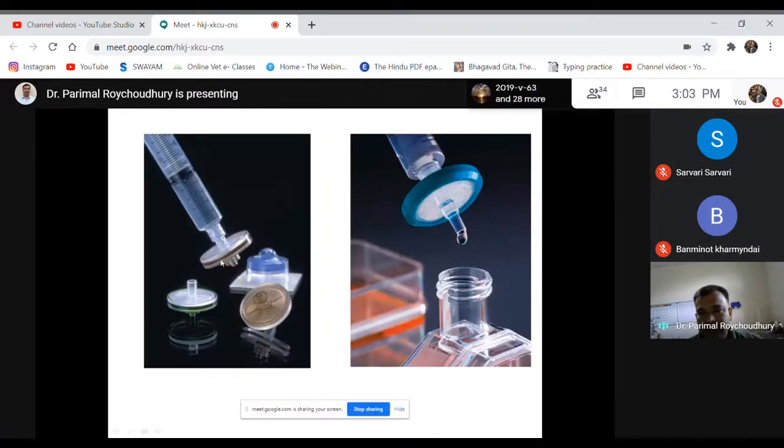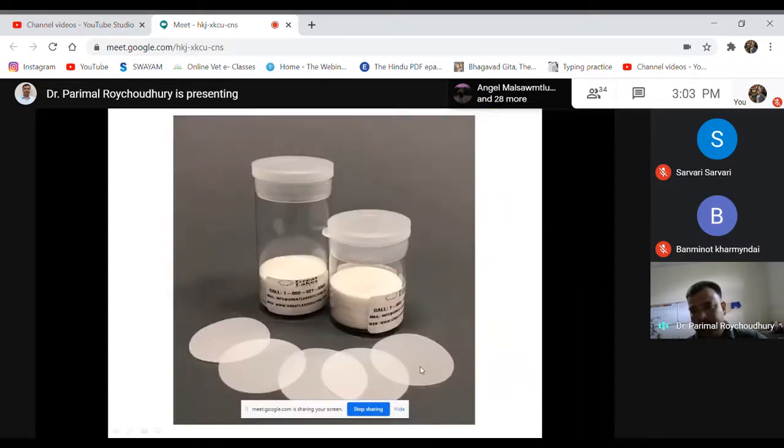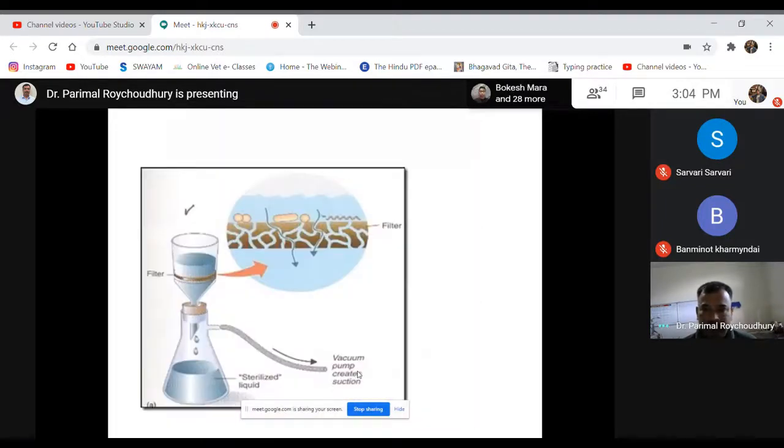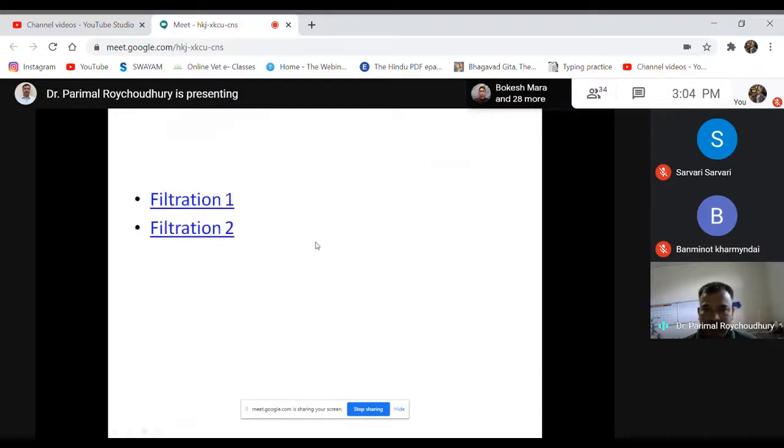Okay, this syringe filter at the center has a membrane filter. As we say, this type of membrane filter is made up of certain chemicals like cellulose acetate or nitrocellulose or PVDF membrane filters. Even nylon filters are also available, synthetic filters. So this is about the physical method of sterilization.